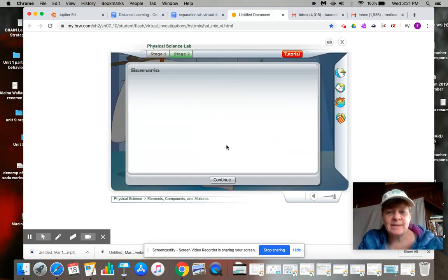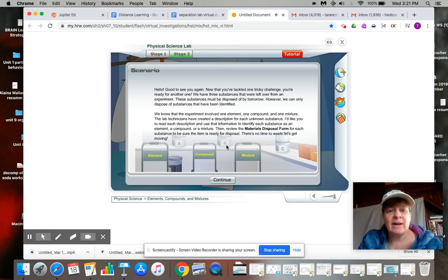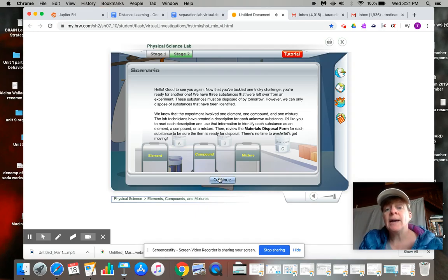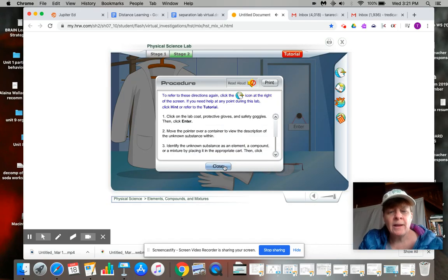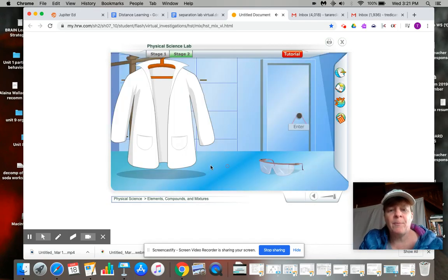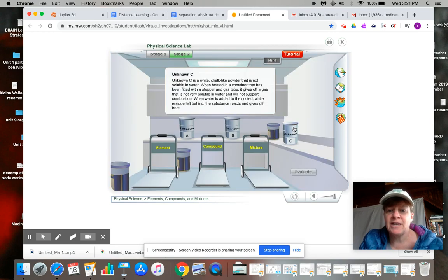Okay. Hello. Good to see you again. We got part two here where you have to identify elements, compounds, and mixtures. That's what we've been studying. And again, we're going to go back into the lab with our virtual safety gear.